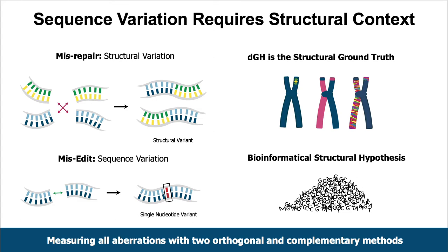When we work with gene editing companies, we often get the question, why can't we use a sequencing method to measure all of the unwanted byproducts in our system? The simple answer is that byproducts arise from 2 mechanisms, misrepair and misediting, that lead to distinct analytical challenges. The more familiar mechanism, misedits, typically generates small indels at the edit and off-target sites. These small indels can be effectively predicted and sequenced using a targeted amplicon method such as GuideSeq.